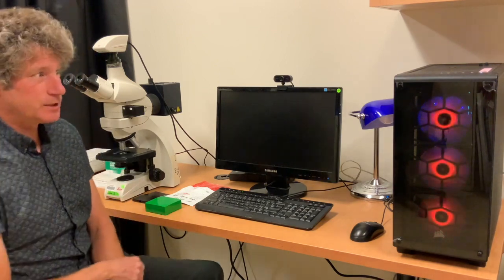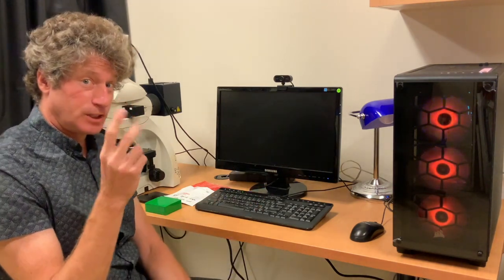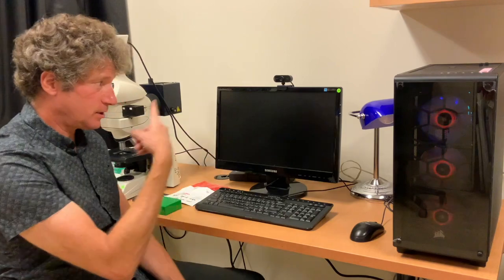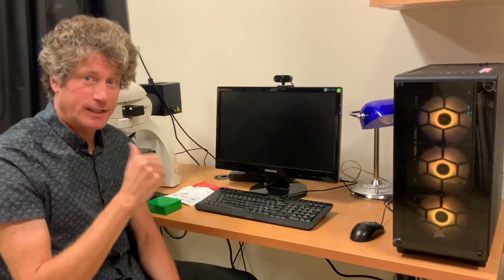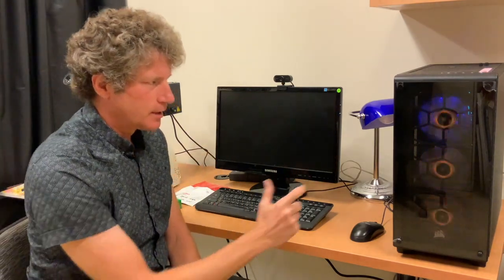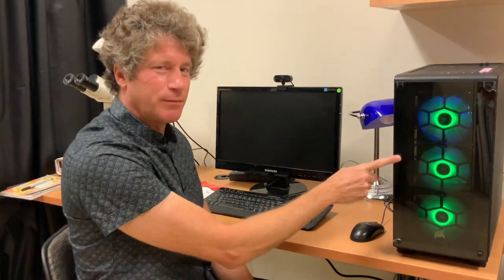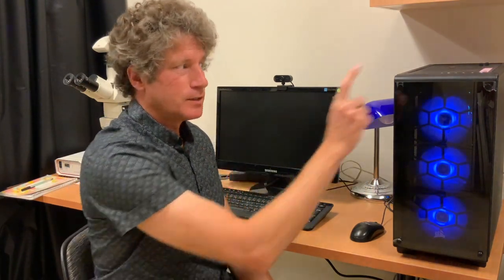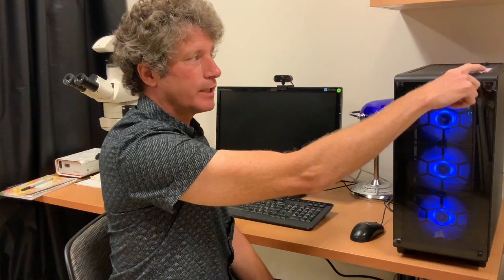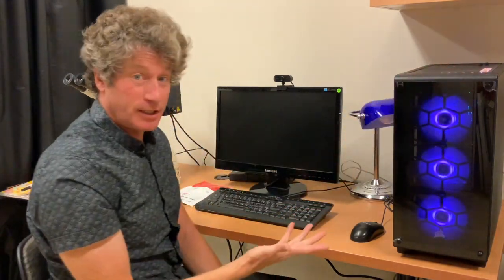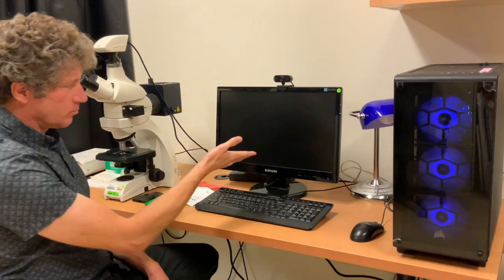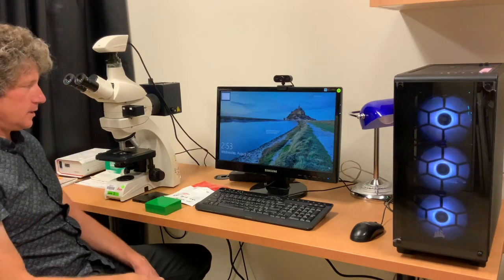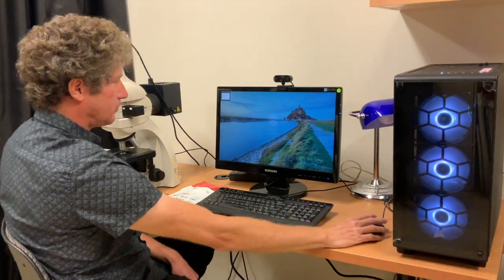There are two of these machines—this one and another one over there. They're basically similar. This computer might be slightly different than that one, but the software will be the same. The power is right up here on the top and it's already on.